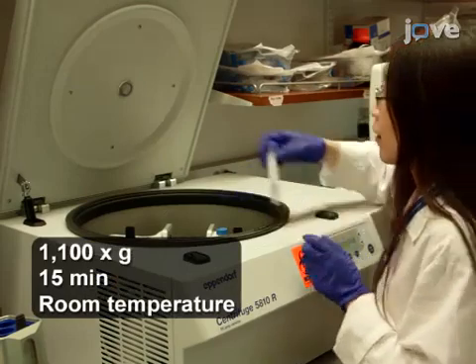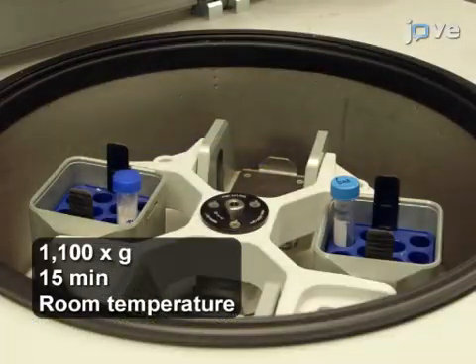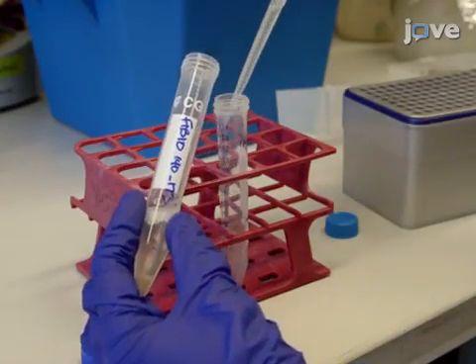Centrifuge at 1,100 times G for 15 minutes at room temperature. Transfer the supernatant to a new 15 milliliter centrifuge tube.